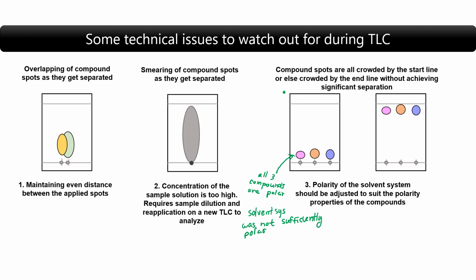So the solution would be to increase the polarity of the solvent system. Then how about this TLC plate?